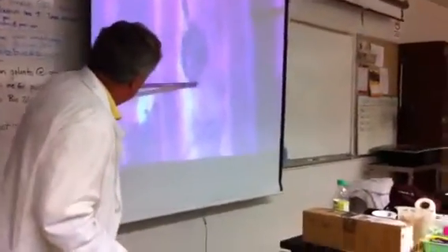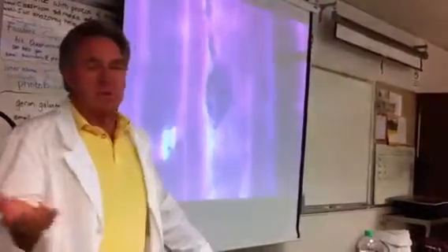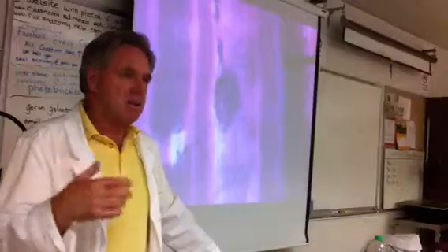So you can see the skeletal muscle because of the stripes. And here's a little bit of the axon coming down, the nerve. And this round, black structure is the synaptic junction. That's where the acetylcholine vesicles are, so the impulse, let's call it the action potential, comes down here and acetylcholine is released, the membrane potential changes, calcium is released from the sarcoplasmic reticulum, and you get contraction. So this is the little junction where the nervous system and the muscles come together.